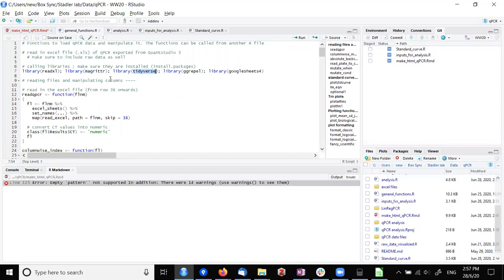I guess if you start using it, then you'll learn all of these things one by one. But if you already start with the code, it's very easy to pick up. Like if you see an error happening here, you go to that line and you Google the functions that I'm using to see where the problem is.